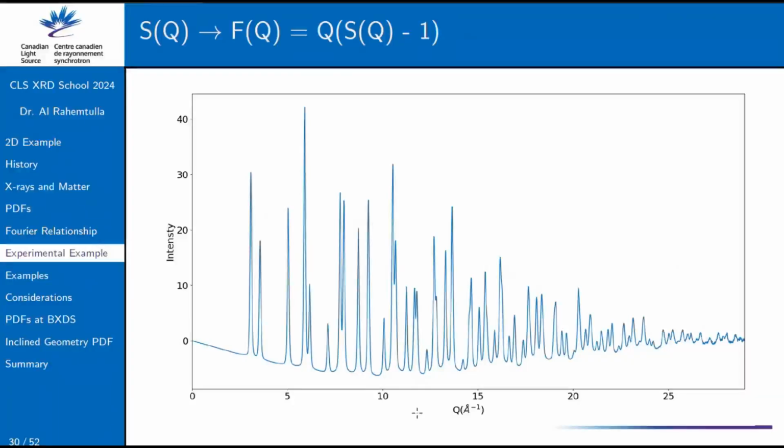You'd probably need to see something. It may even be possible that what may look like an amorphous hump could actually be a lot of Bragg peaks that are almost stacked on each other, creating the illusion of an amorphous peak. It may mean that you just need slightly higher resolution Bragg scattering to resolve that out. For something like that, I think all the compromises of PDF might hurt your measurement more than it would help.